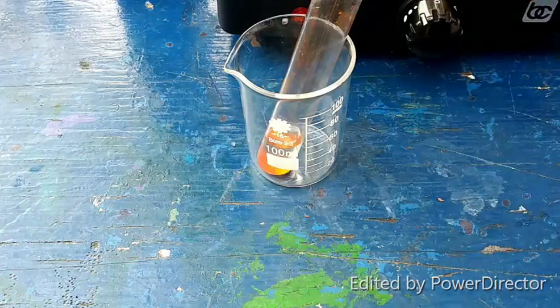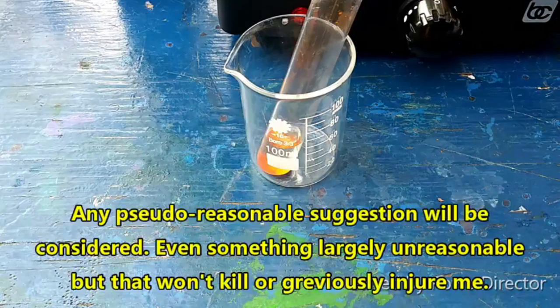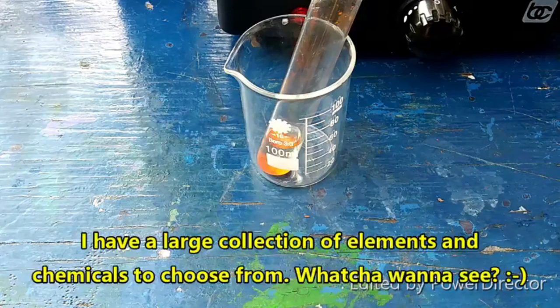But that's not very scientific. I'd love something to react it with. So I'm calling on all of you, my people. Give me an idea. Something that won't make it explode would be preferable. But this is supposed to be even stronger than bismuthate. It's in concentrated nitric acid. Come up with an idea of something to use it to oxidize.